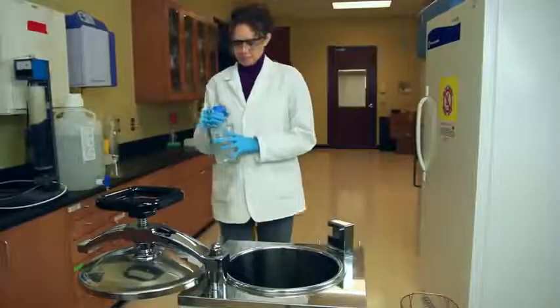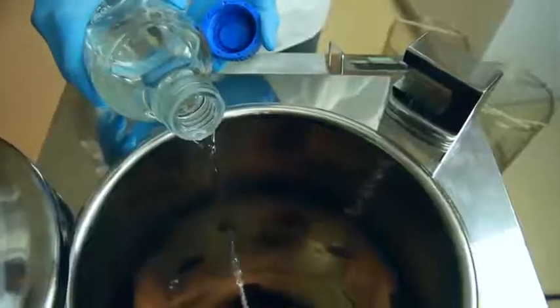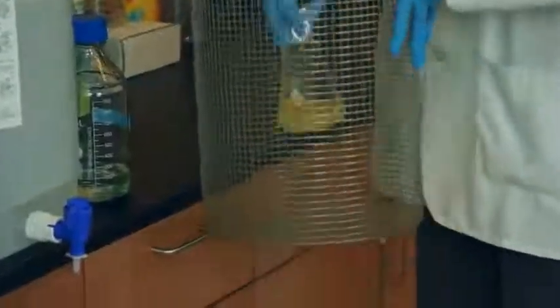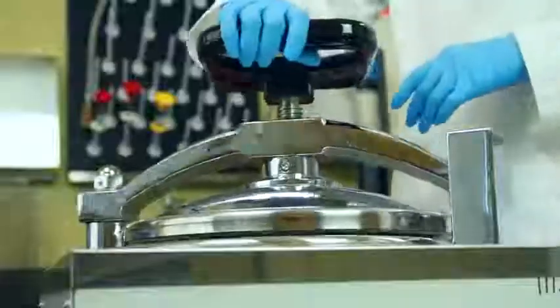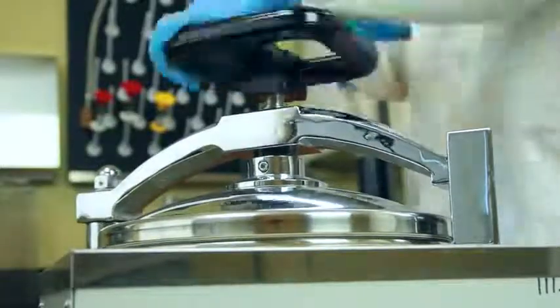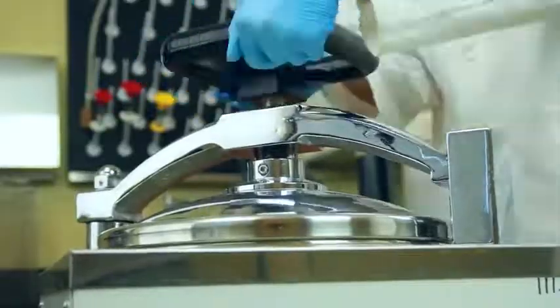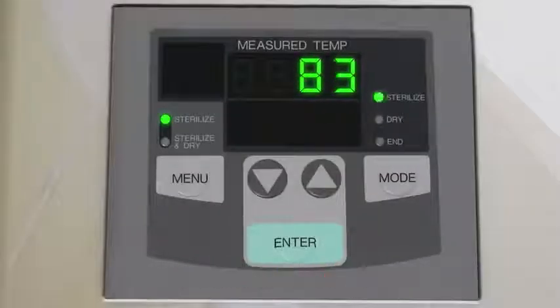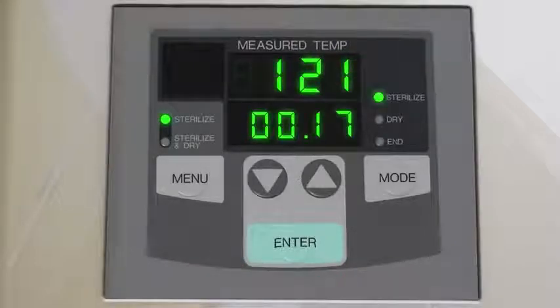Power on the autoclave and make sure the drain valve is closed. Add deionized water to the level indicator line. Place the flask of culture media into the basket. Insert the basket, close the lid, and turn the handle to create an airtight seal. Use the control panel to set the mode to sterilize, the temperature to 121 degrees Celsius. We'll run this cycle for 17 minutes.